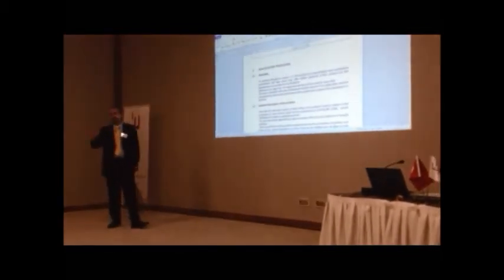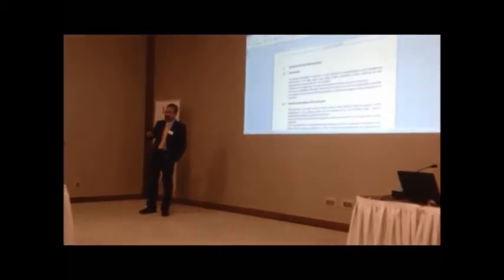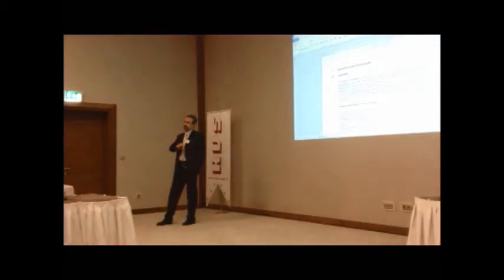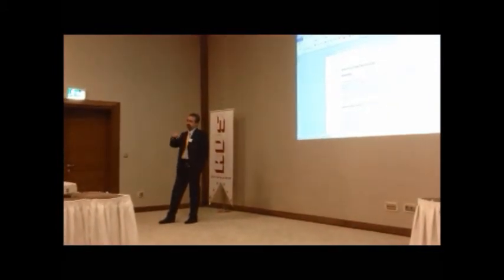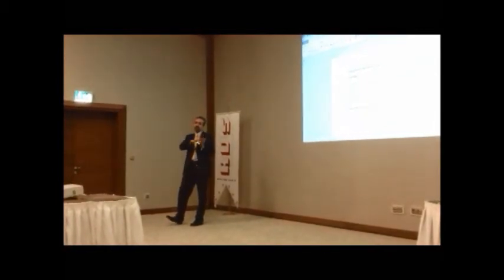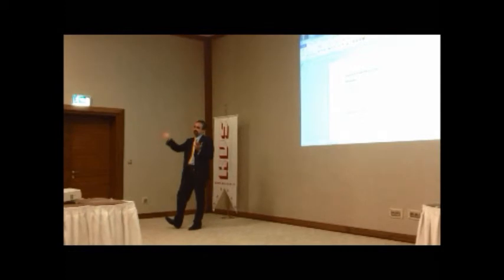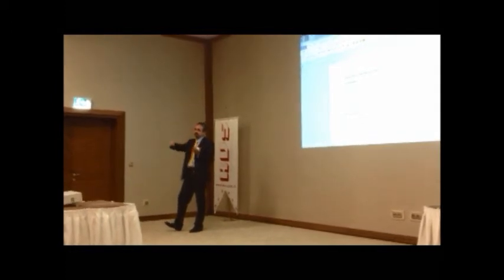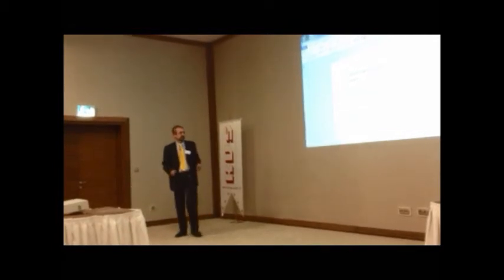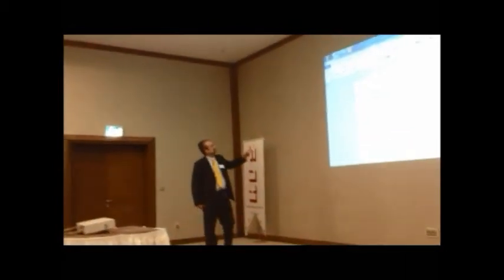Here we have two possibilities. Either we use exactly the same document that you have approved. Once that is fulfilled, it becomes the report. Or you keep the protocol, we make a copy conforming to the protocol, and we fulfill the copy. It's up to you.